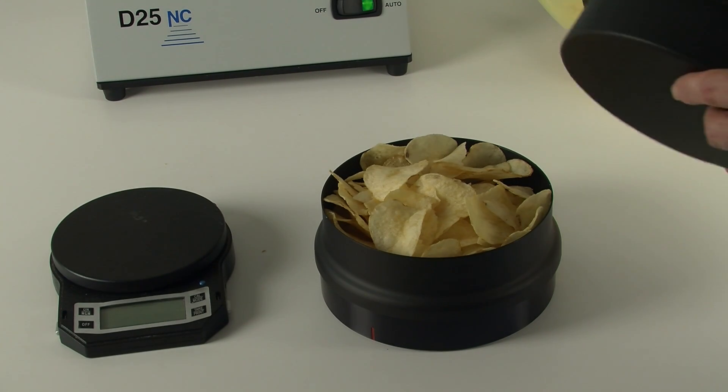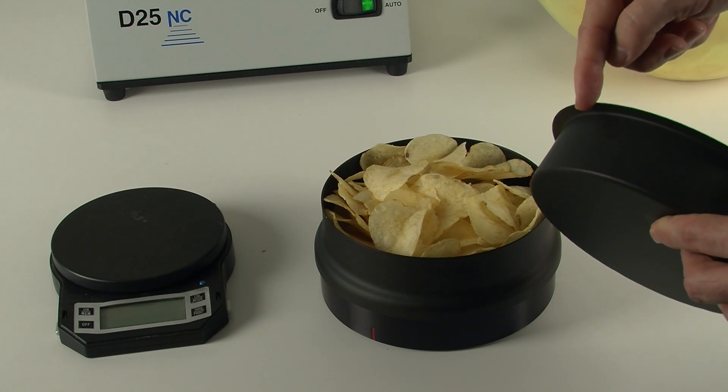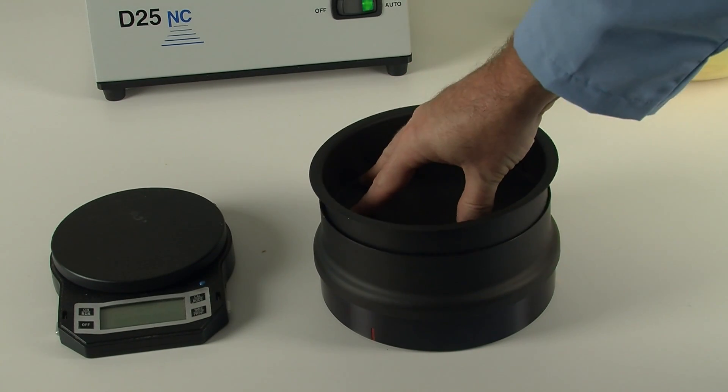Place the pan on top of the chips and press until the rim of the pan reaches the rim of the collar. Press firmly and evenly.